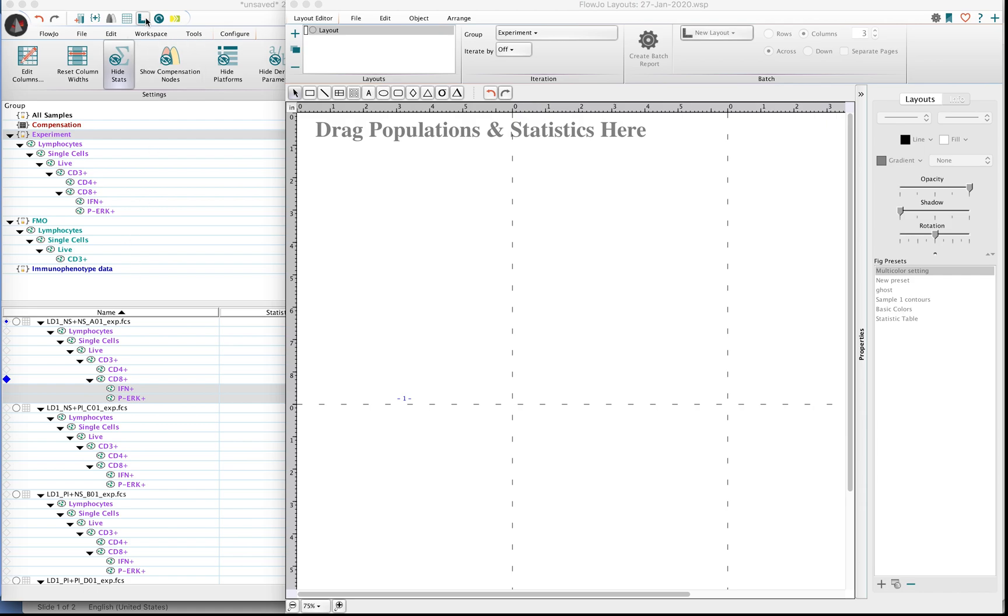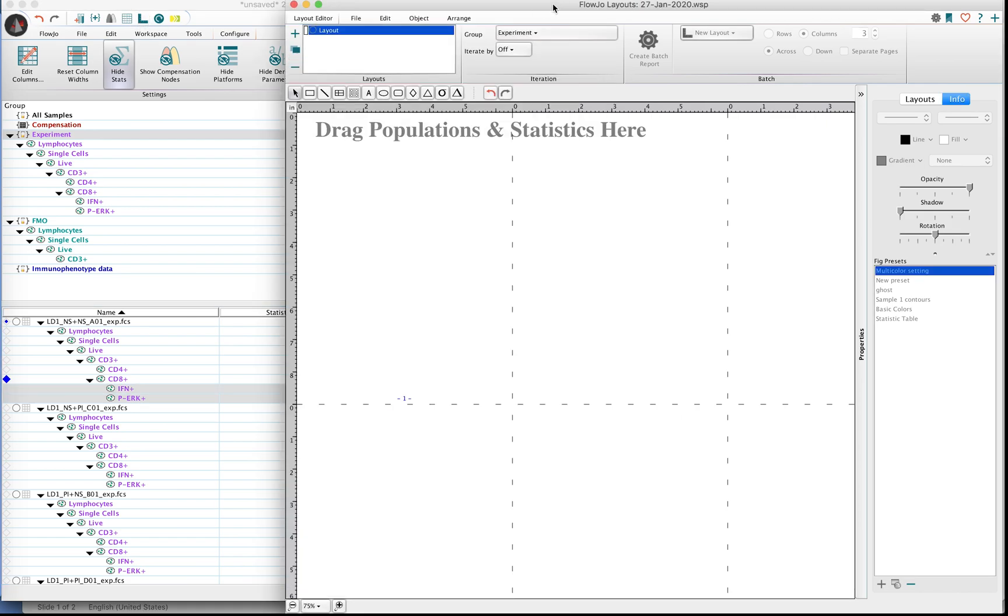In order to invoke the Layout Editor, go ahead and click the L button at the top of your workspace. This will open up a sheet. Oftentimes it will kind of open up to the right of your workspace.